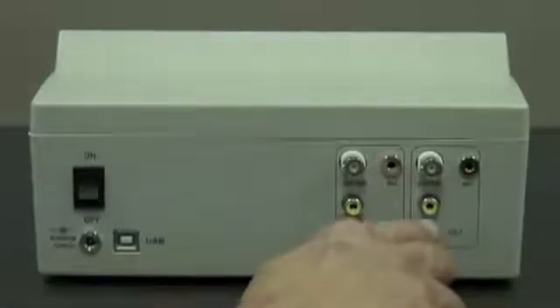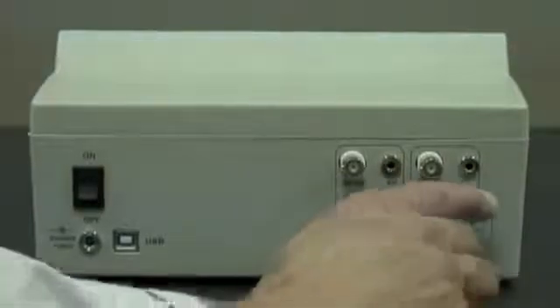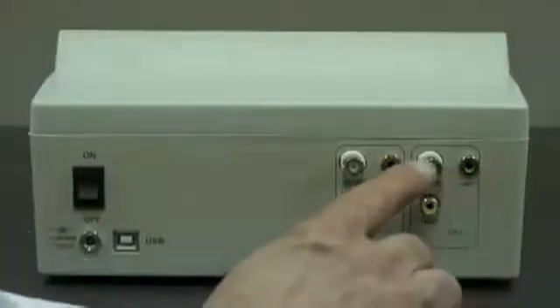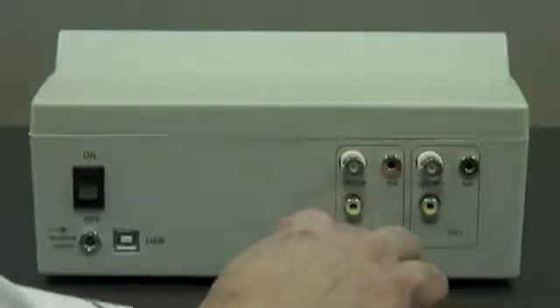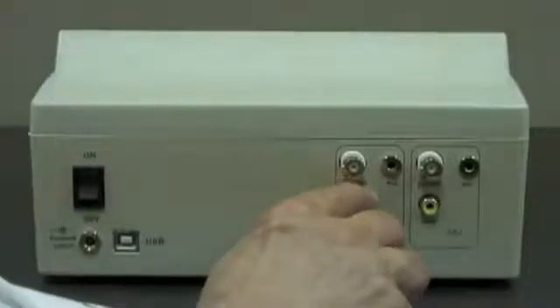When I look at channel one, I see the input for the temperature probe, a BNC connector which is the input for either a pH or ORP electrode, and in the case that I'm going to use a reference probe as a half cell, I simply plug it into this connector and then plug the indicating probe into this connector. Exactly the same setup for channel two, with the exception that we're working with an ion selective electrode and/or an ORP probe.